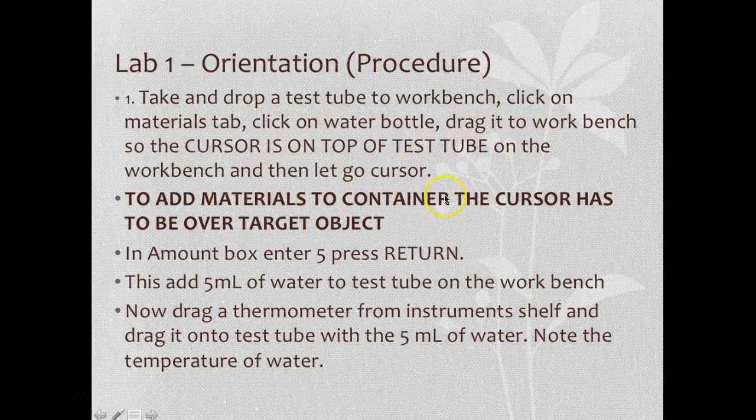So the cursor has to be exactly placed on top of that target, okay? And then you will get a box in which you can enter the amount of a material that you're going to add to the glassware. Okay.